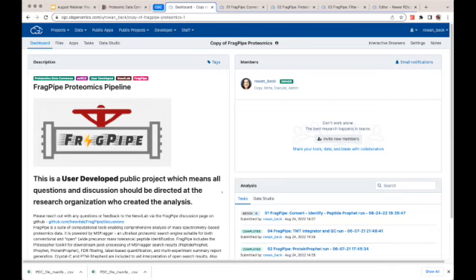What I presented in the first 30 minutes is basically what I'm doing in the lab, including adding the new functionality to MSFragger and working with Dan Pelavsky for the Glycopeptide identifications, and also the label-free and isotopic label things is also part of my research project in IonQuant.